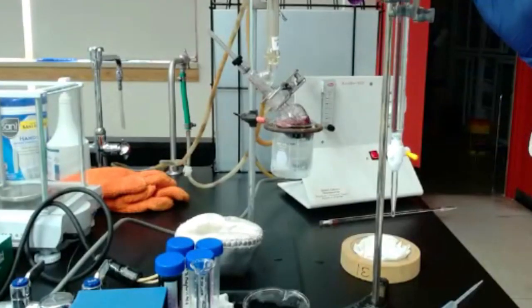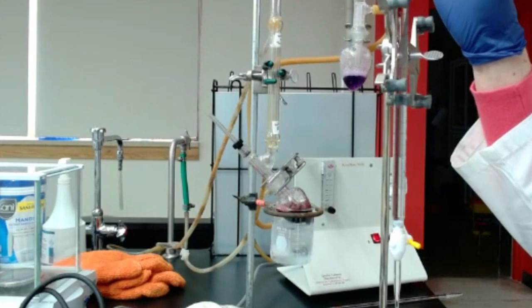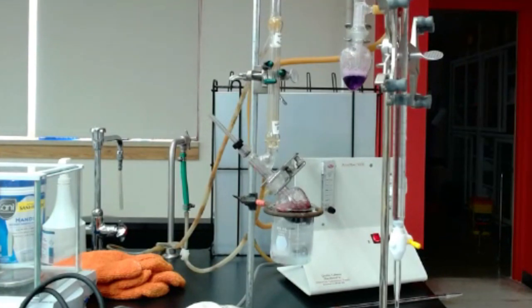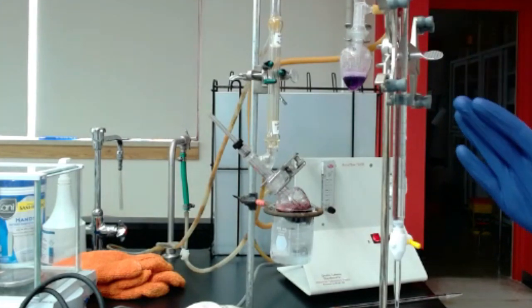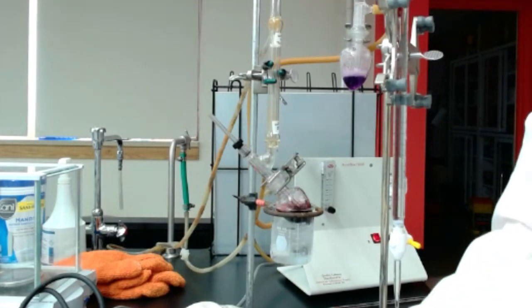So now I did the titration. I will record the final volume I have, and I have 22.6 milliliter of sodium hydroxide. So same, I'm going to do exactly the same calculation. 22.6 minus 18.1 gives me how much total SO2 I have in this Pinot Noir wine. And so I have 72 ppm, so 72 milligram per liter of total SO2 in the Pinot Noir wine.